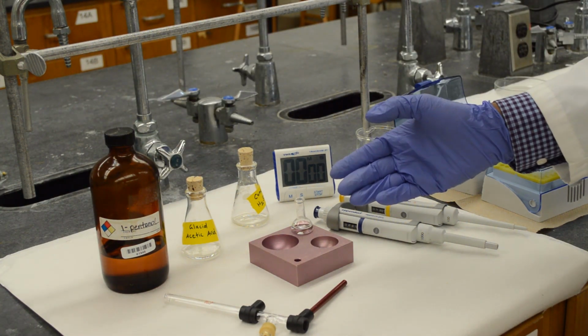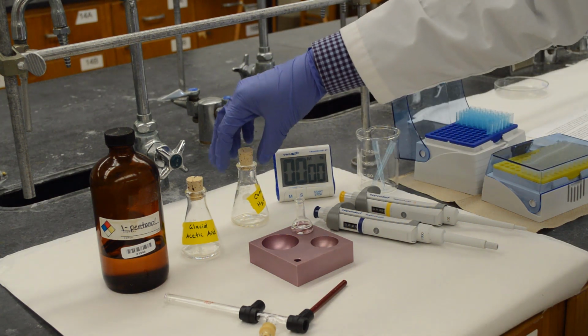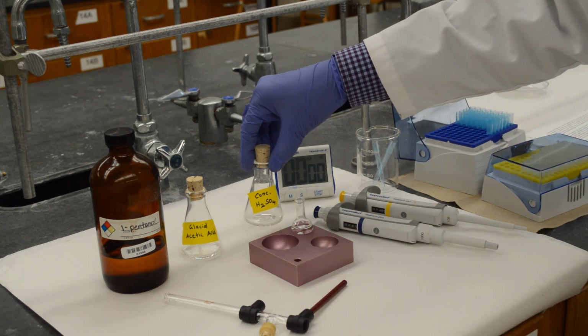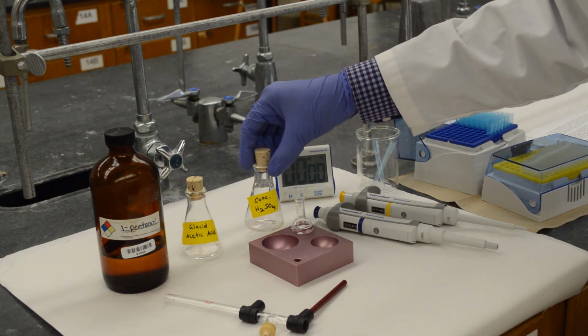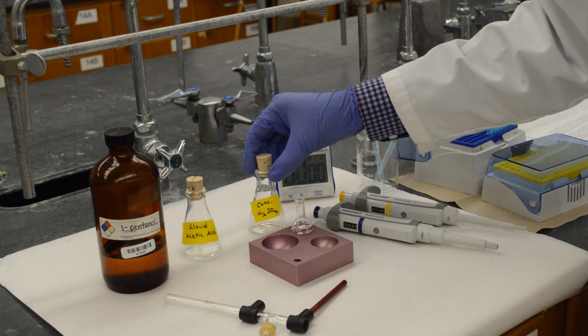This is a Fischer esterification. We need an acid to catalyze the reaction. Here is the concentrated sulfuric acid. We just need a catalytic amount of sulfuric acid, and it's not a good idea to open this here. I'm going to take this to the fume hood.